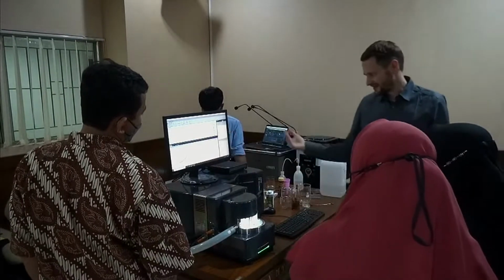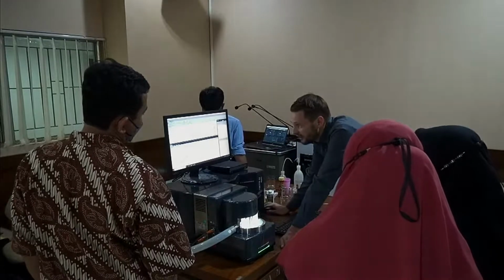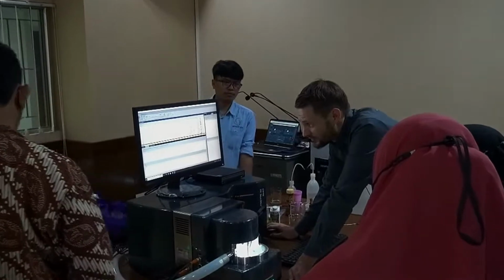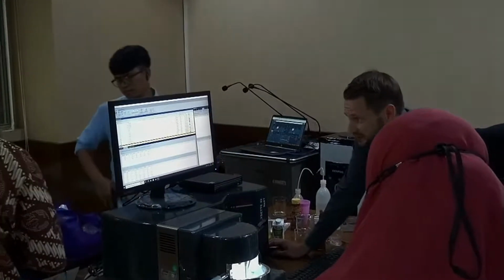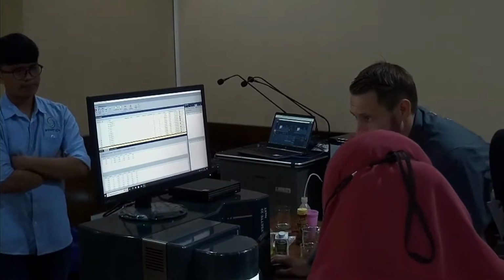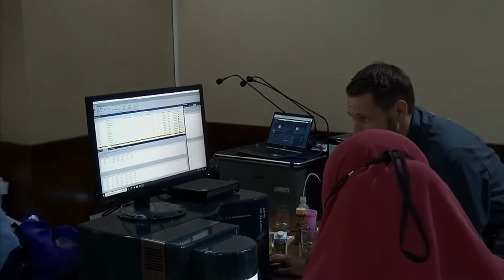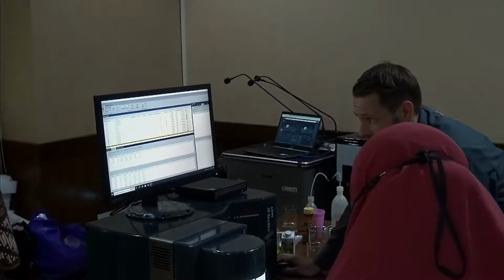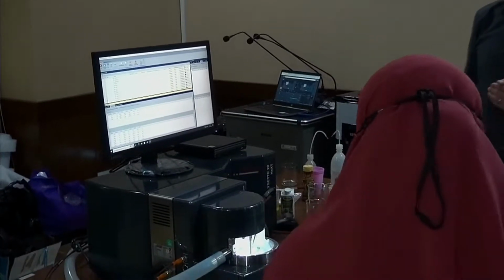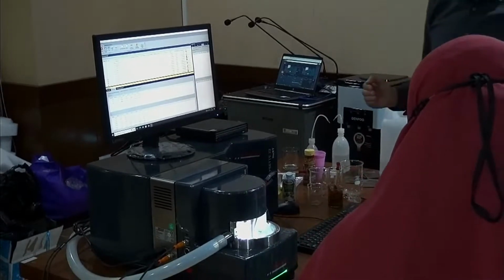Actually, it's not that significant if you look at the D50 values. So we have 2.9 shifting to 2.6. This is not really such a big deal. But if you look at the D90, there you see it much more. So here we had 8.5 or 8.3, and we shift that to 9.4, 9.3. So we actually increase the D90 by 1 micrometer using ultrasonic.